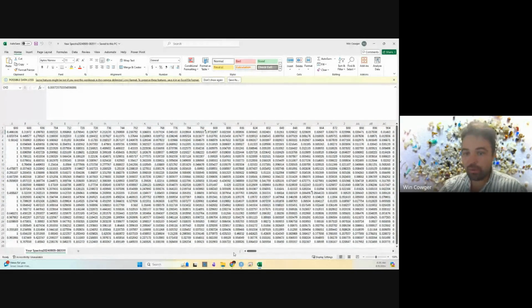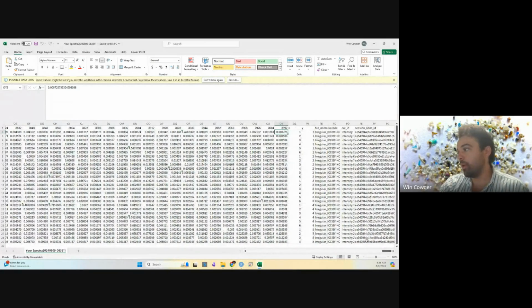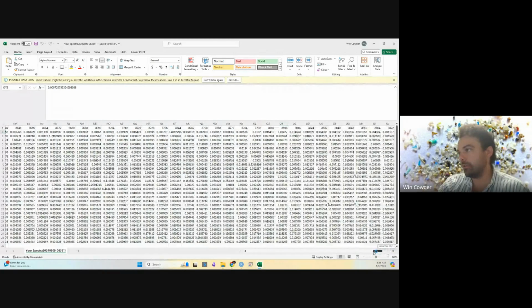So for a lot of people, this format of spectral data is very convenient. And so maybe it'll work for you right away. If you need it in a different format, you can use the R package. The R package reads in this format, and it'll export it in other formats: JSON, RDS, CSV. We have a ton of different other formats that you could export it as.